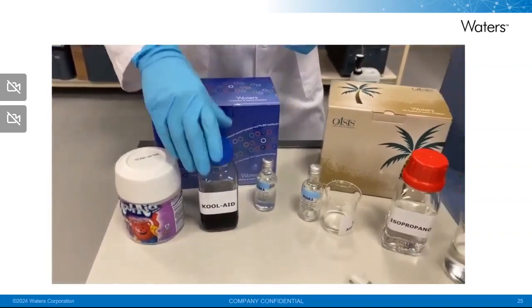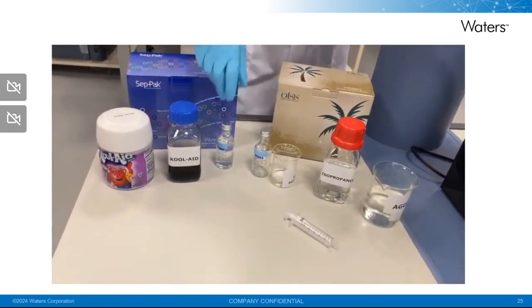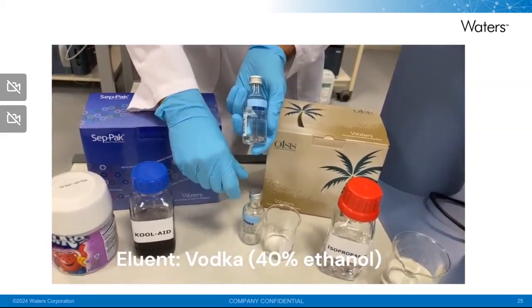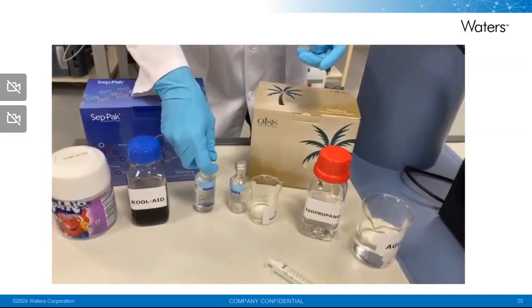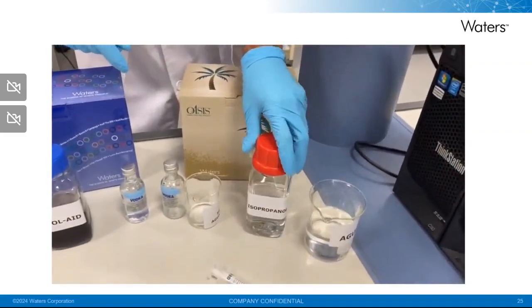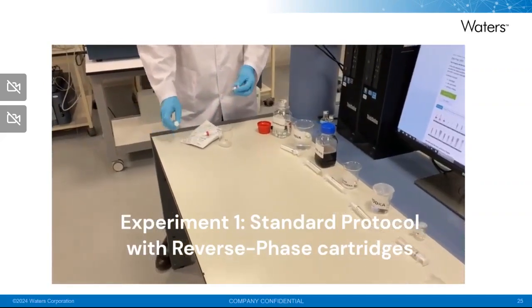Regarding the solvents to use, we're going to be using solvents of different strengths. For instance, for elution, we're going to be using vodka, which contains 40% ethanol, and we're going to be diluting this vodka 1:1 with water for the wash step. Then we're going to be using isopropanol for the conditioning step, and we're going to be using water for the equilibration. So let's start with the experiment.